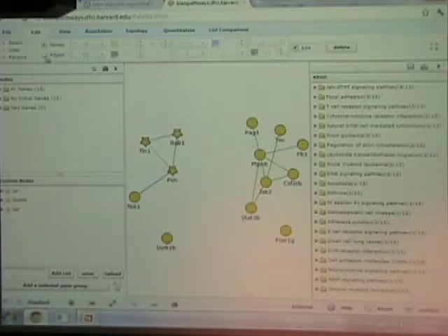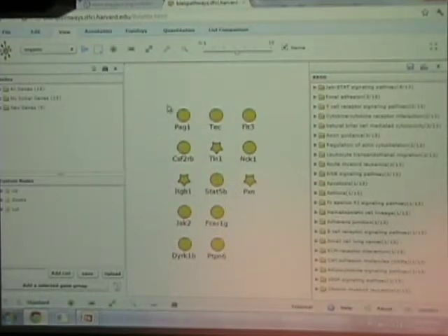And as a matter of fact, I'm going to delete all edges, because I want to demonstrate a tool which tries to make sense of a partial set of proteins. So I'm going to select all the edges, delete them, and re-layout the data. So imagine that you do a repeat experiment, and you've got a subset of the data that you were seeing before.